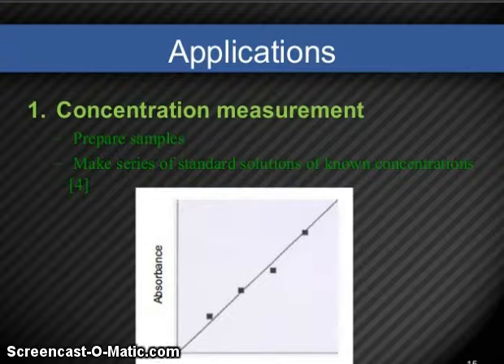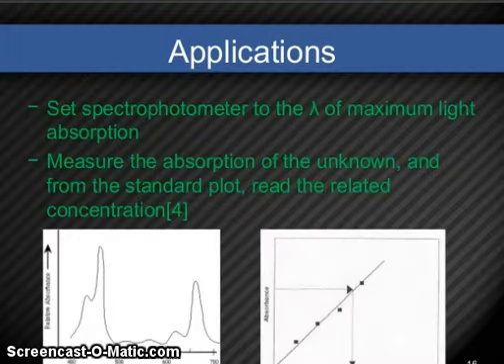So applications. Concentration measurement: prepare samples, make a series of standard solutions of known concentrations, set the spectrophotometer to lambda of the maximum light absorbance, measure the absorbance of the unknown, and from the standard plot read the related concentration.